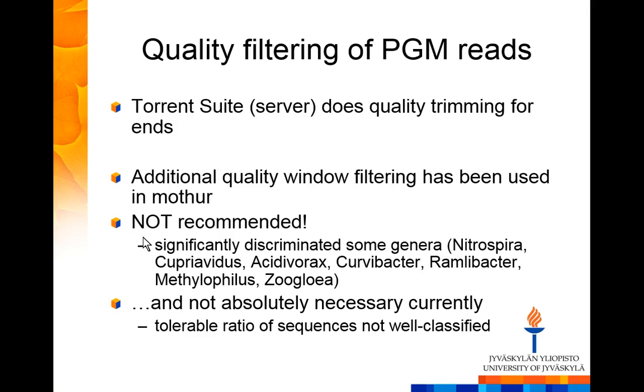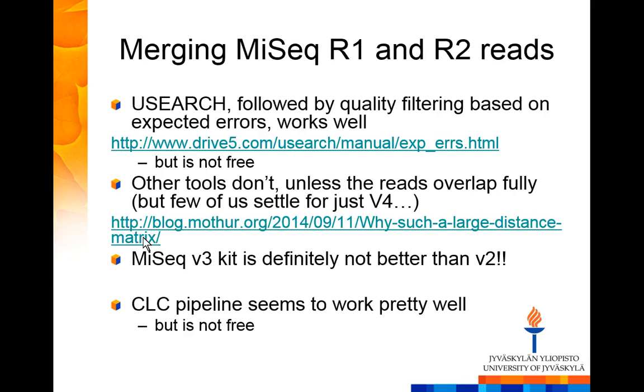May I ask one question about the previous topic, the merging of reads? So if we have V3, V4 data, and we don't have these commercial, better-version tools, would you even recommend using only forward or reverse reads?